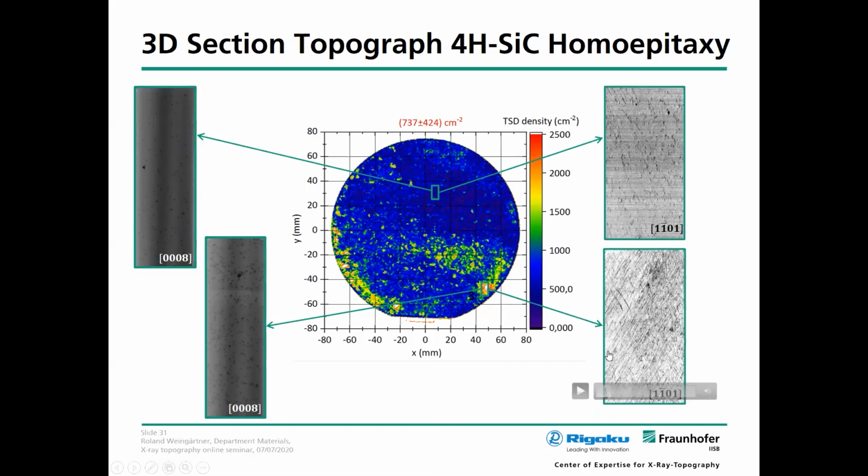These are our killing defects, our triangle defects inside the epi-layer. Now this is the surface, and these triangle defects are there, and now we are in the substrate again. This is now only substrate, and the rest, of course, is always substrate. So therefore, with this method, you can actually see where our defects are.